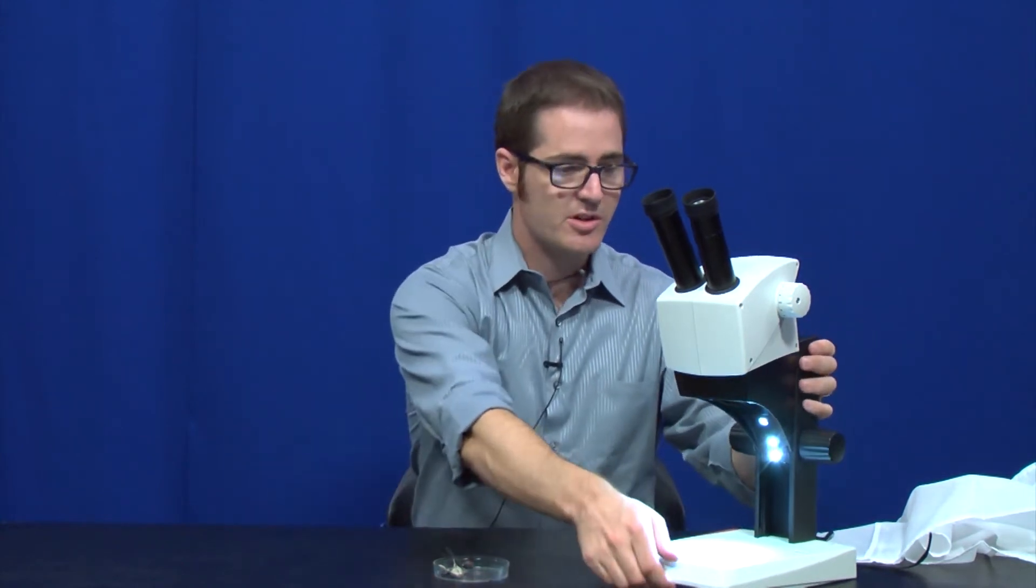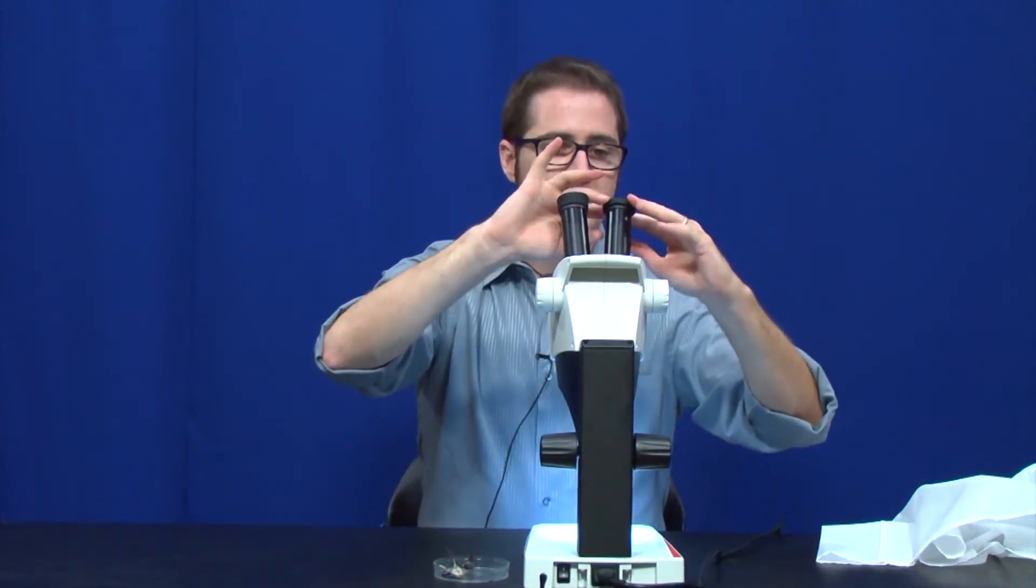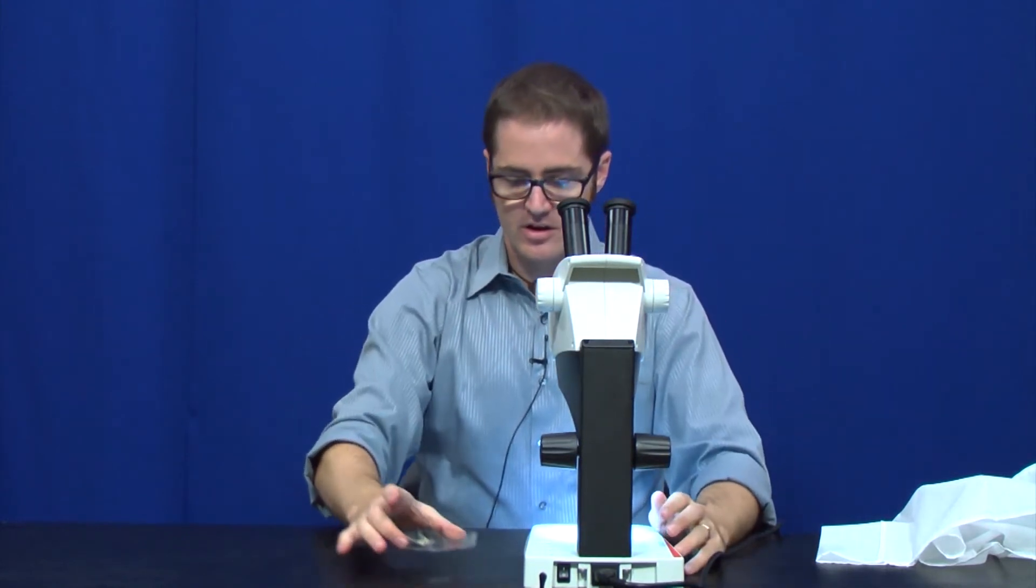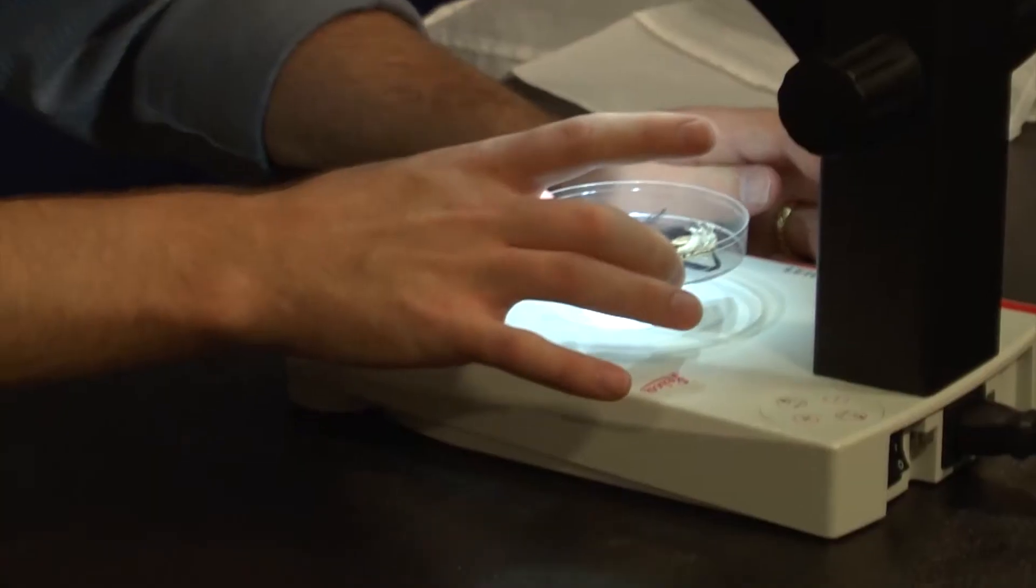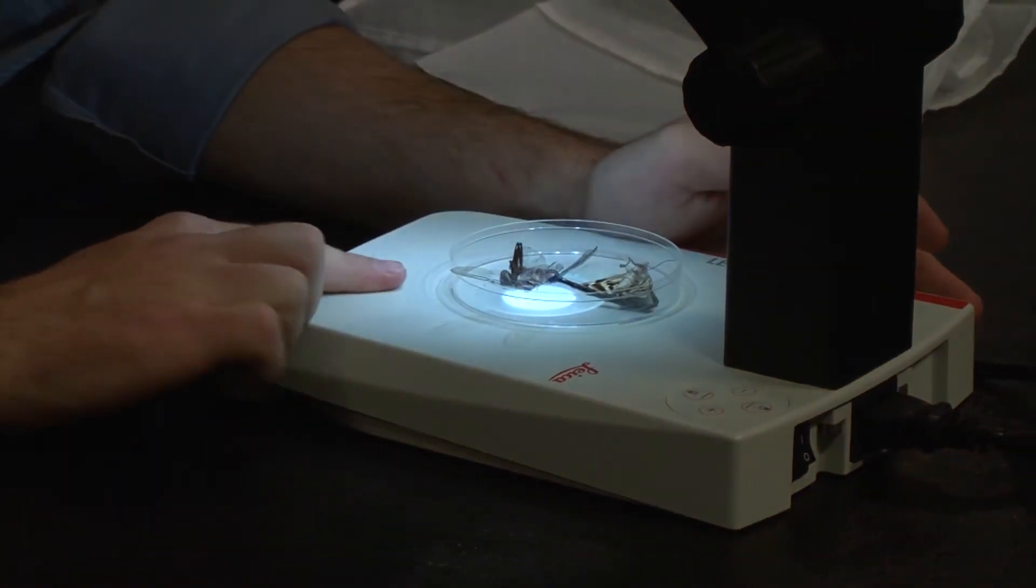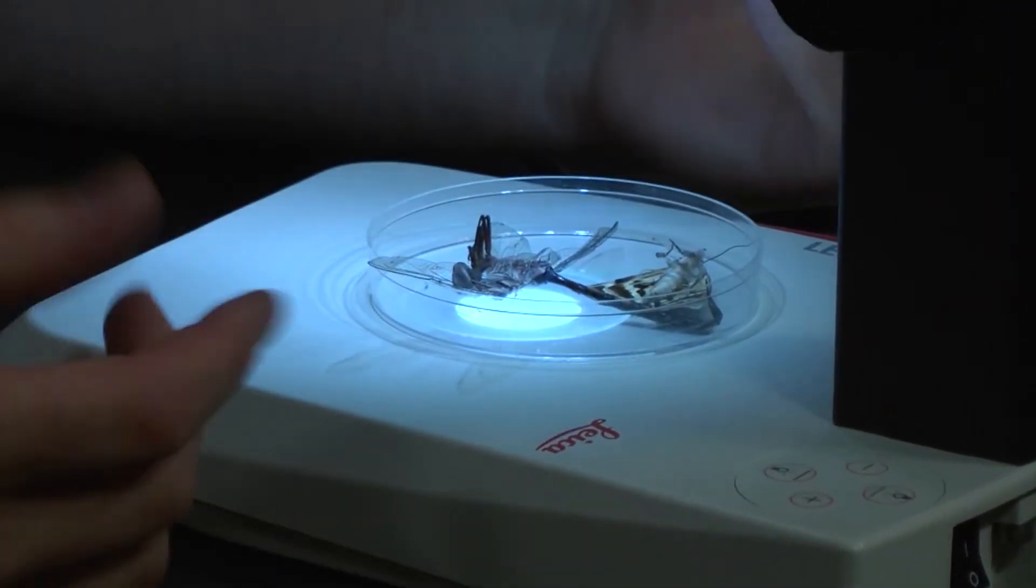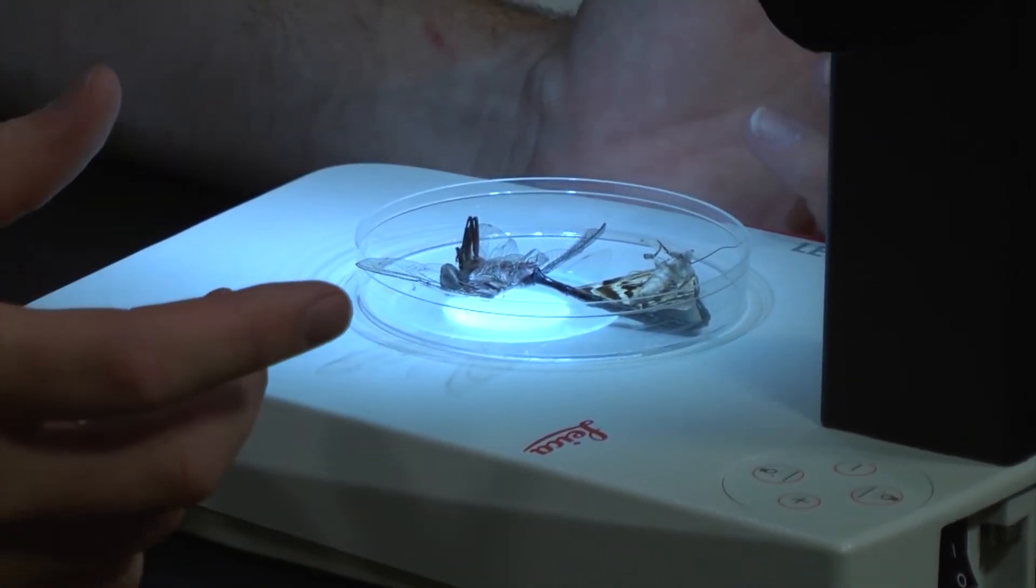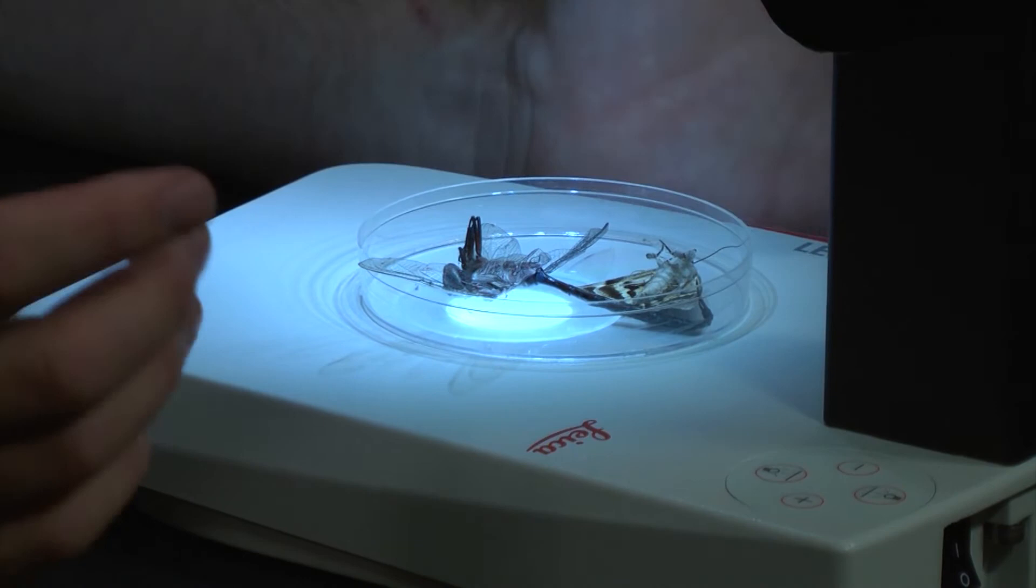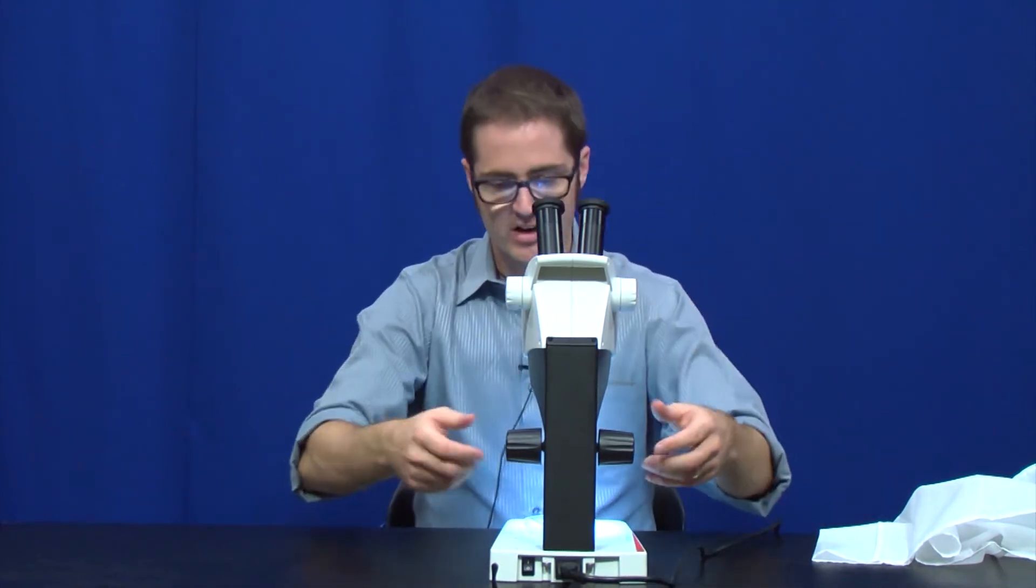In terms of actually using the microscope, it's just like any microscope you've probably used before. I'm going to roll these eye cups back down because I am going to wear my glasses. We'll take our sample here. In this case, it looks like I got a little moth and a dragonfly, and I'll put them on the base here. Another thing to note about the base is it is water resistant, so if you do have a sample that's in water or a solution of some kind, you don't have to worry too much about it sloshing out of your petri dish.